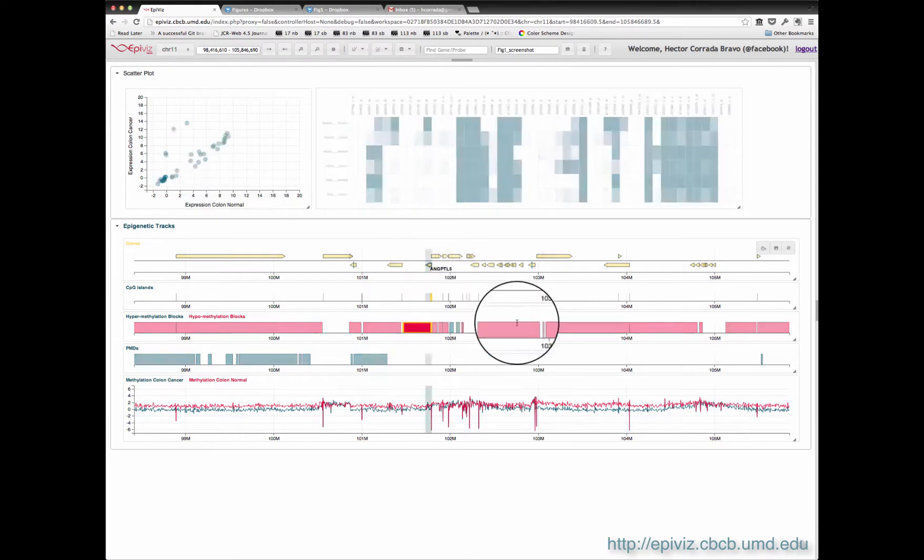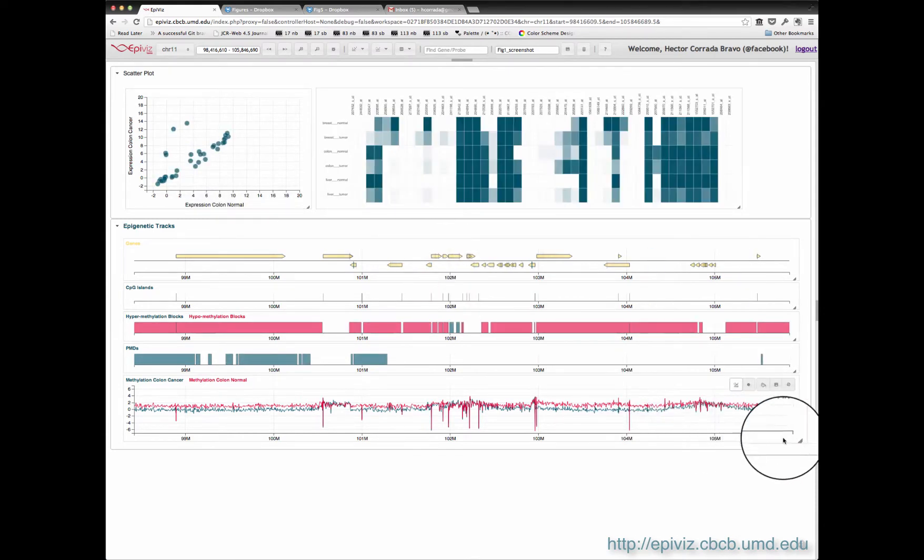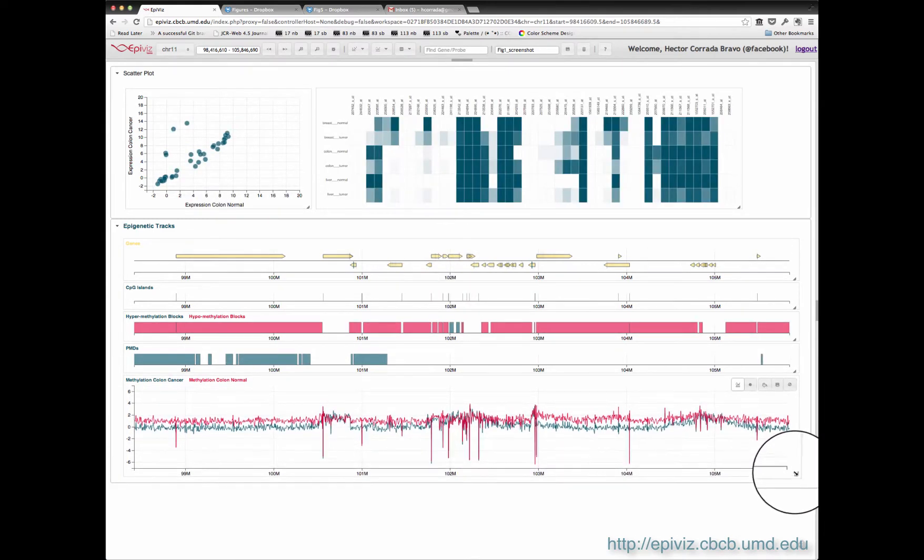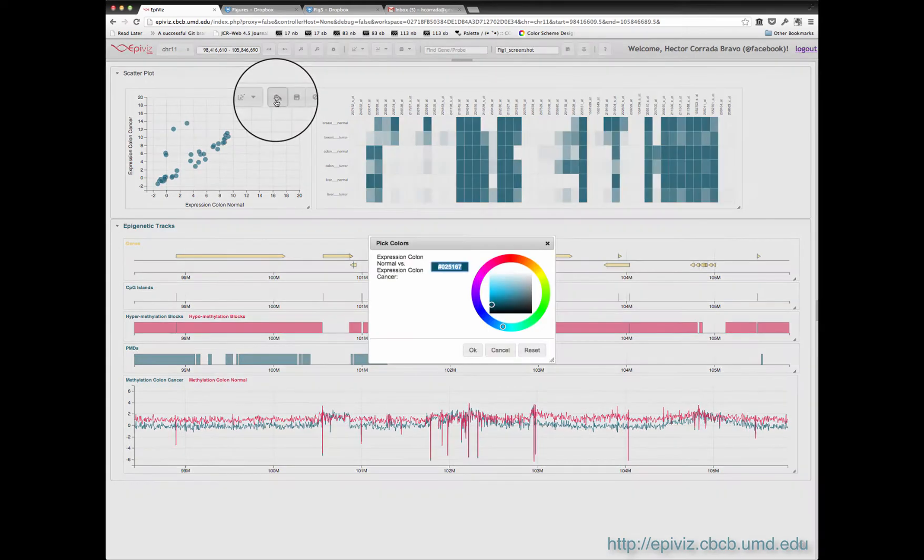Tracts and plots are resizable, easily reordered, and colors can be selected.